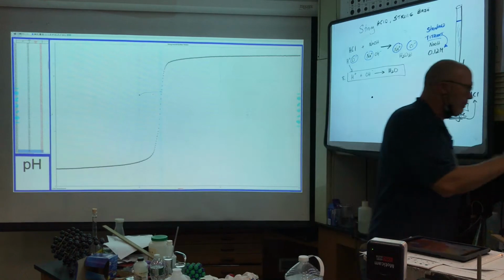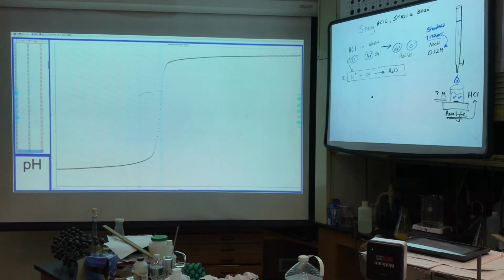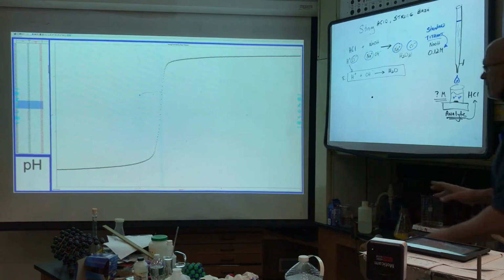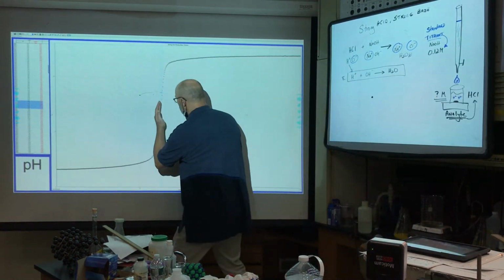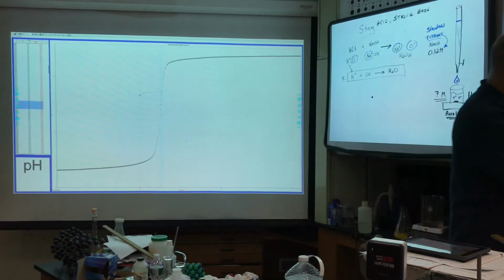So I'm going to scroll up to my heart's content, and it's hard to see where you guys are looking. And I'm going to drag that down. Now if you had this file on your computer, you can do that. So all I did was take my cursor and I dragged it to pick this area, and now I'm going to go find those points, okay?